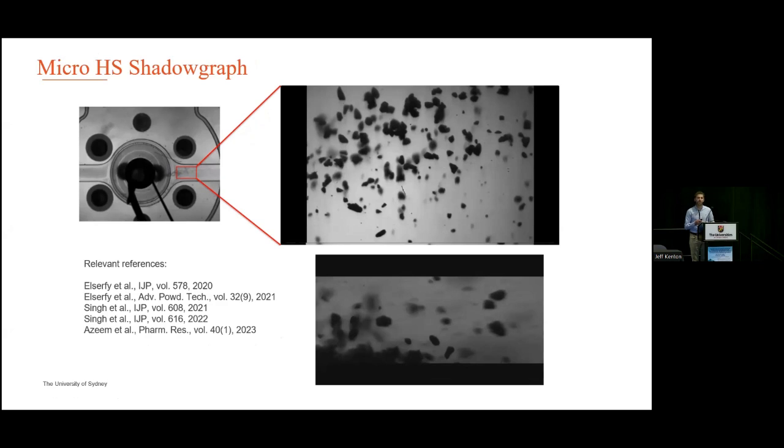The difficulty here is dealing with defocused particles, and we've spent probably the last 8 or 9 years working out how we can deal with that kind of problem. There's a lot of literature from the fuel spray space on characterizing defocused droplets, and we've translated a lot of that over into this space. That gives you an idea of the kind of images that you can extract. We've published a lot of work on this over the last few years, a couple of those with the FDA, with Ross, who is probably in the other room.